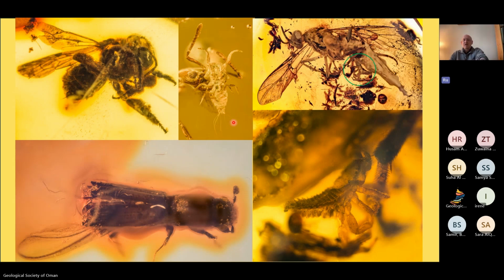But when you look up close in that lower right image, you can see it's got this pseudoscorpion just hanging onto its leg. And that's really common, that there are little creatures that catch rides with bigger creatures to get translated to somewhere that's new and more favorable. And the lower left image is another example of that, with the little tiny nematode worms hiding under the wing covers, the elytra of that little beetle. So let's go over to that part of the world.